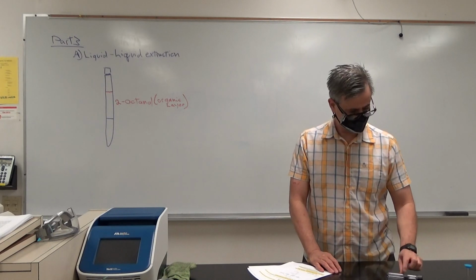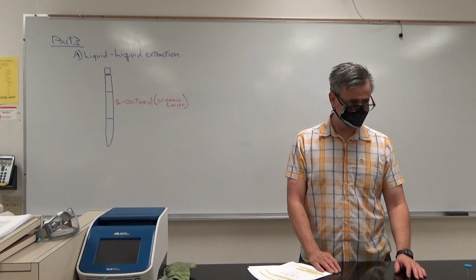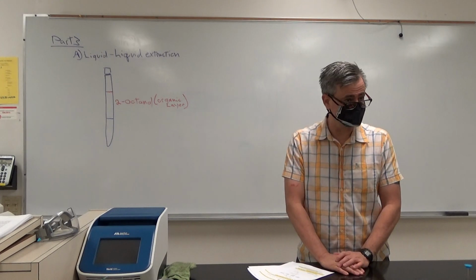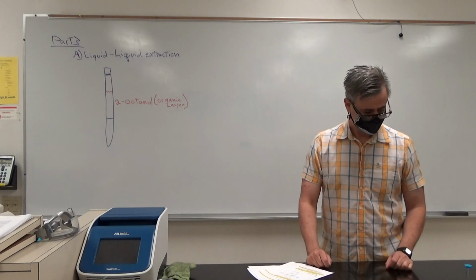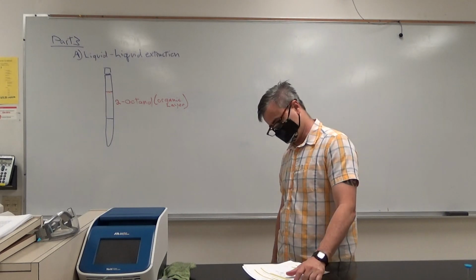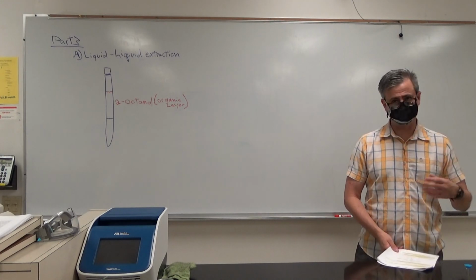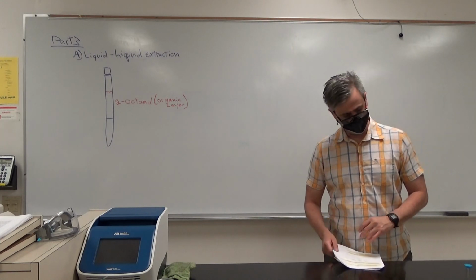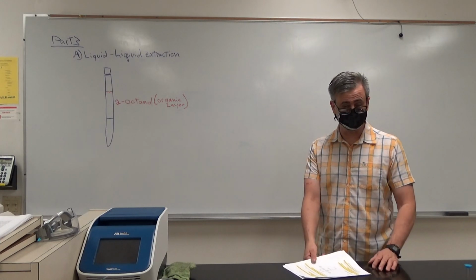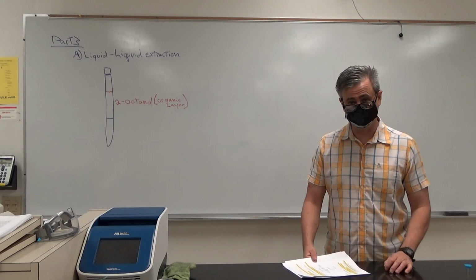Yeah. Okay. Are we not using the vortex thing? What's that? Oh, the vortex thing? Yeah, you can. You can use the vortex thing. I never do. That's just as easy. There are some applications with the vortex thing, mostly in biochemistry, where they have very specific instructions. Okay, vortex this for 2 minutes or whatever. So, in a liquid extraction of organic chemicals, you're going to get your desired results in a few moments of shaking.